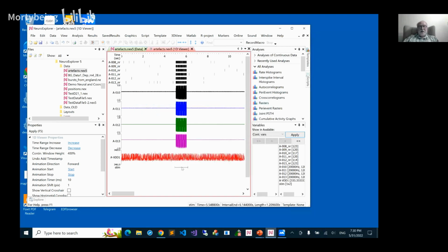The next step, in NeuroExplorer, probably you know already, you can analyze data not only from the whole recorded data, but data from a set of time intervals, right? Just select data from these intervals and ignore the rest. To do this, we need to have a set of intervals without this stimulation, without the artifact.